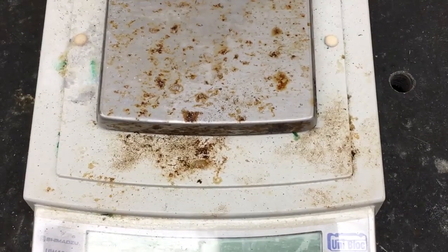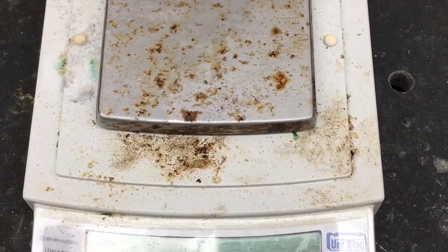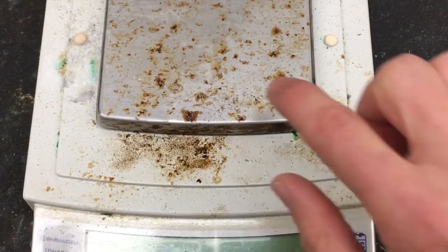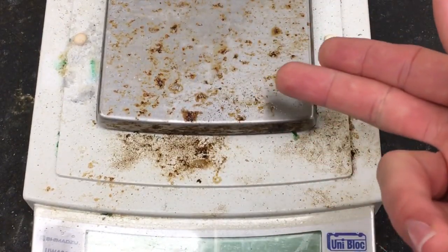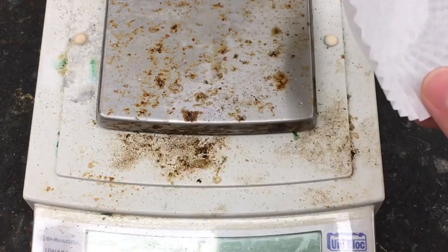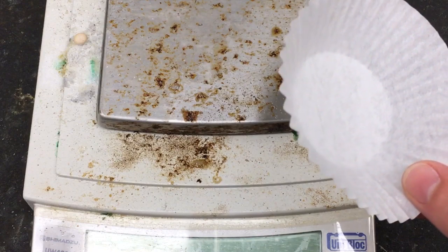Okay, everybody. So first things first, we need to obtain a mass of our Teflon ball. We're just going to utilize this view so you can see what I'm doing in the lab. First things first, we always want to keep this weighing pan clean. You know, it's Hawaii. Even stainless steel rusts, sometimes there's a chemical spill. We use these things, they get a little worse for wear. That's why you would always use some sort of medium between this and whatever you're trying to mass.